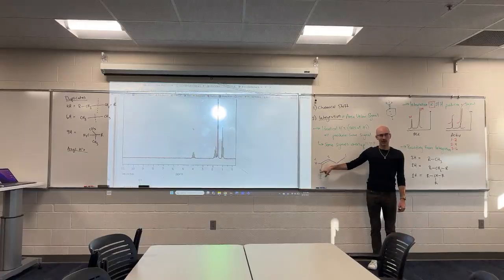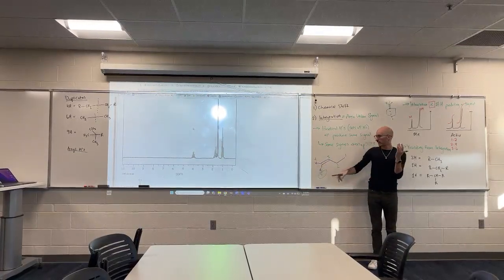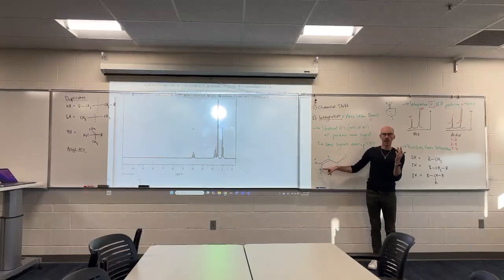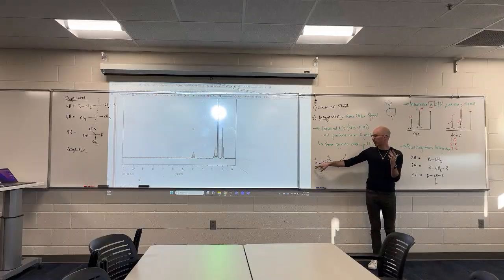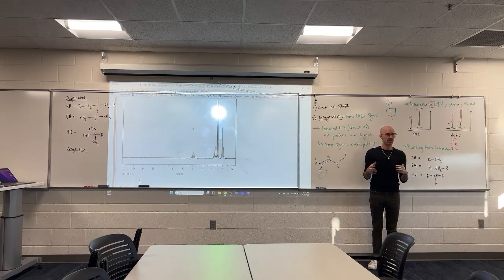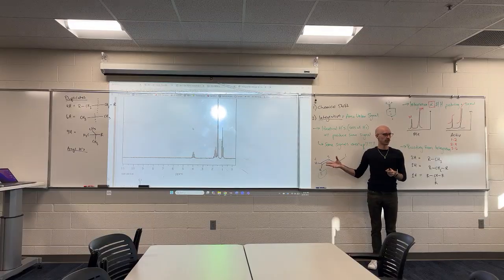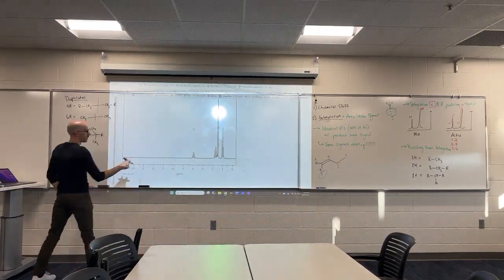Sometimes the 2 hydrogens attached to the same carbon give such different signals, and a hydrogen on the other alkene carbon overlaps with one of the other 2, where you don't even get 3 unique signals, and it's not these 2 who seem more similar to each other overlapping. It's actually this odd man out overlapping with one of them. You get these weird combinations. It's kind of hard to give any sort of rule for the alkenes.